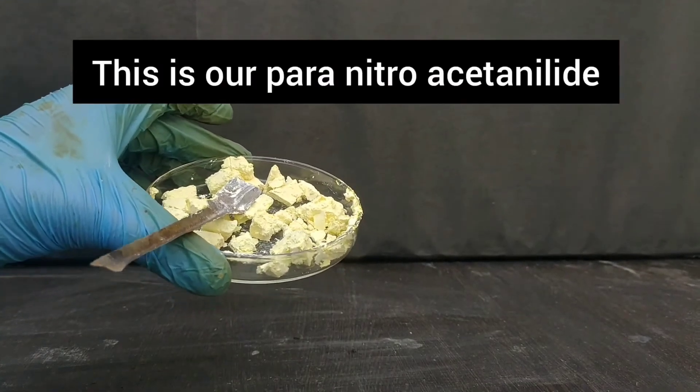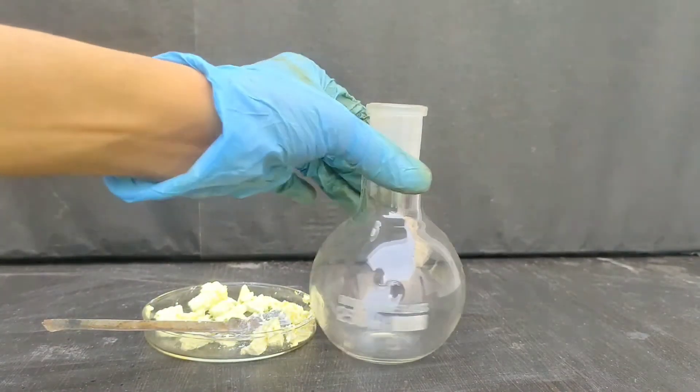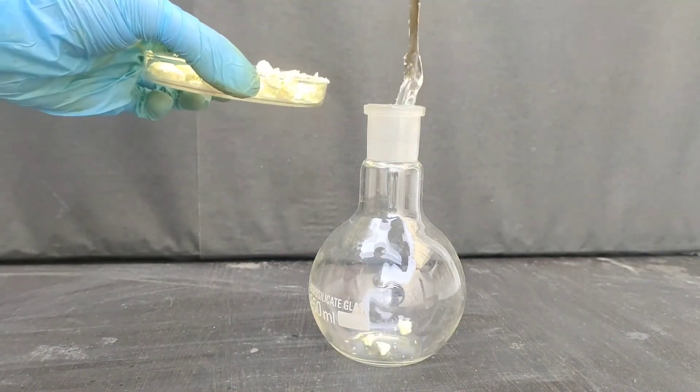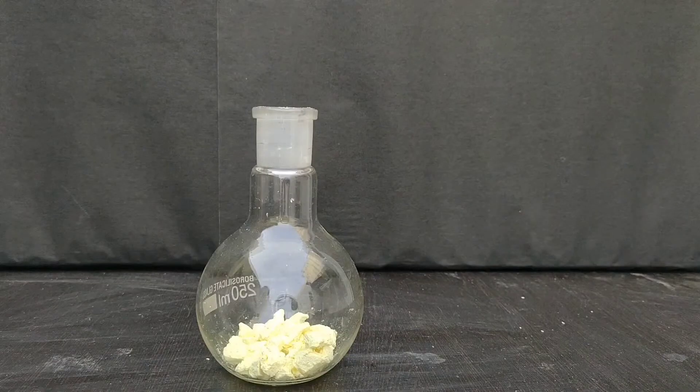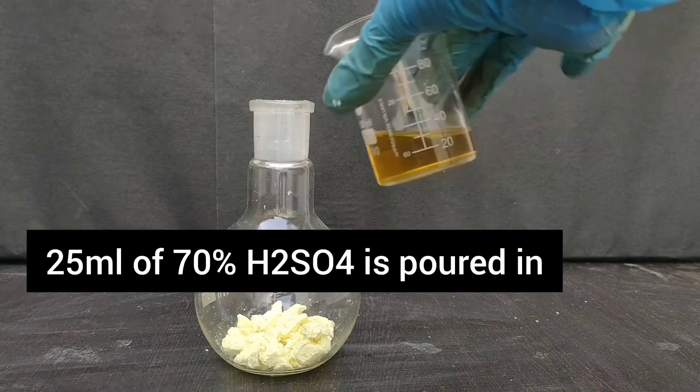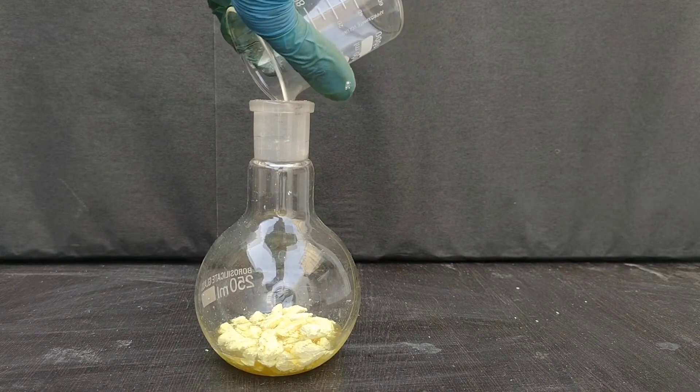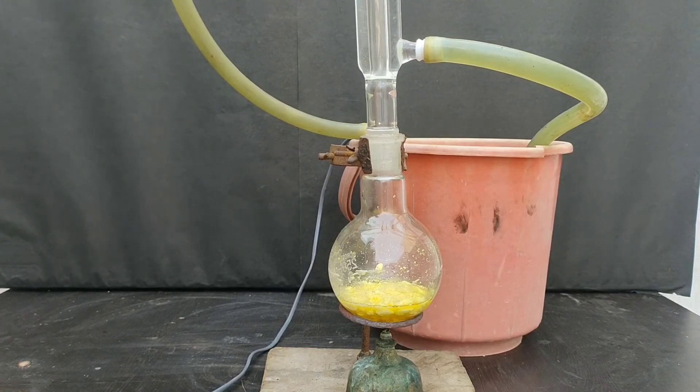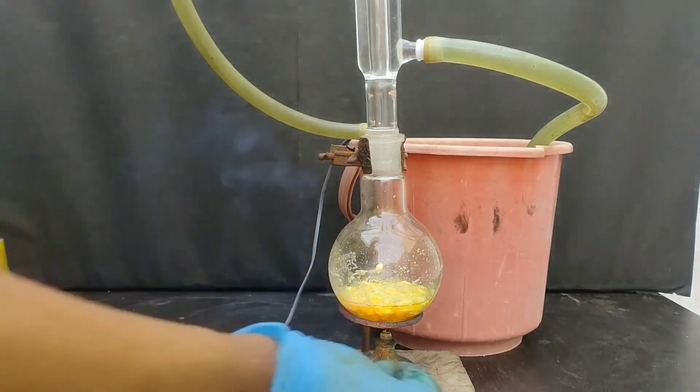The product is para-nitro acetanilide. Now, I will take this in a flat bottom flask. All the para-nitro acetanilide is transferred into the flat bottom flask. To this, we will add 70% concentrated sulfuric acid solution that we have prepared. The flask was set with a reflux condenser on the top, and the contents were gently heated with a spirit lamp for half an hour.